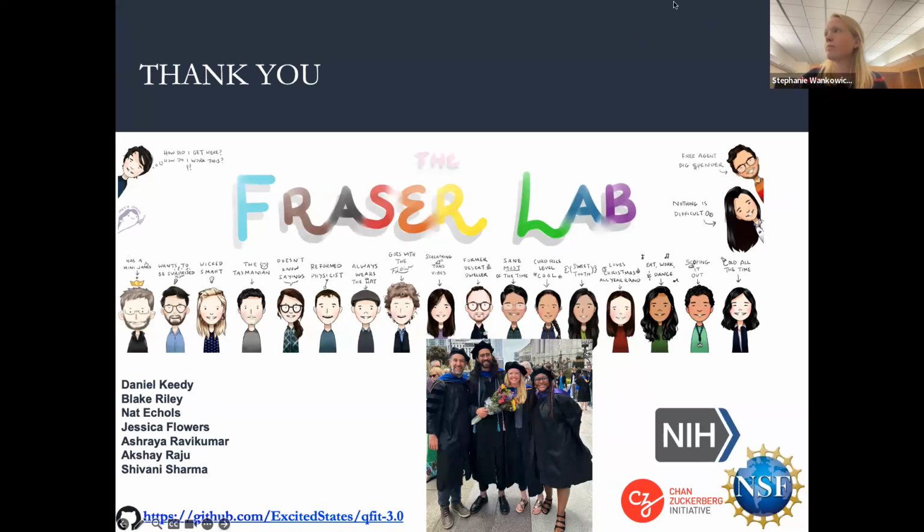At higher Rfree values, maybe from low resolution structures, the program does not seem to significantly improve the deposited Rfree values. Am I wrong? What about the program's performance at low resolution maps?